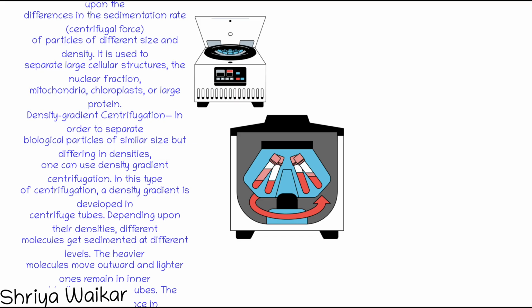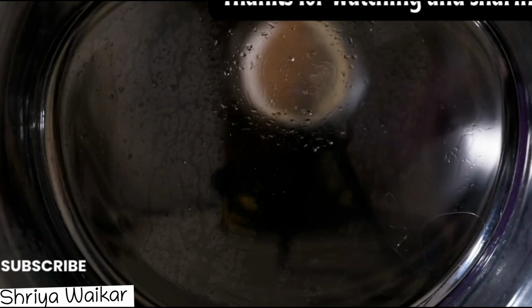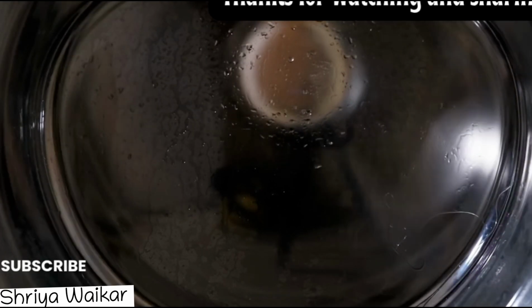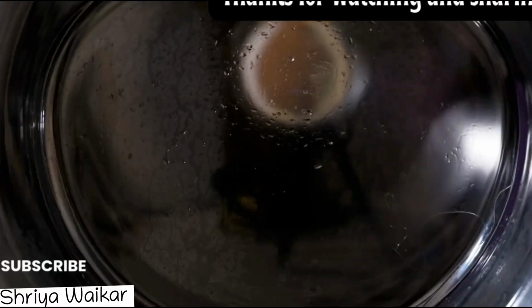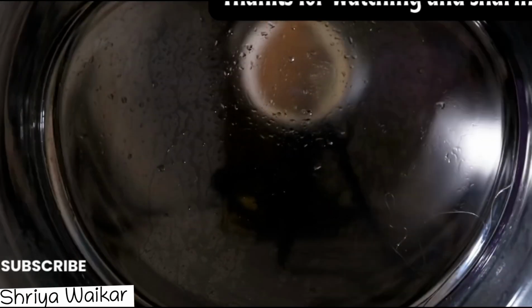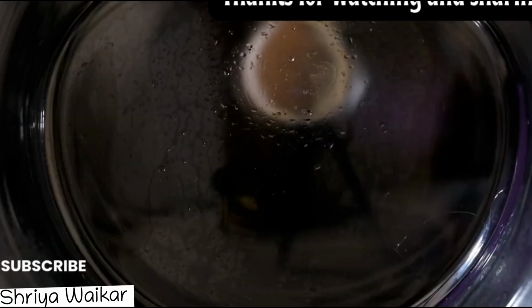It consists of a base, a rotating container, that is the spinning vessel or rotor, and a lid. The spinning vessel is the centrifuge tube, and the cell extract or mixture is taken in the centrifuge tube and allowed to spin at a desired speed, revolutions per minute, that is RPM, for a specific period of time, leading to the settlement of particle material at the bottom of the centrifuge tube.